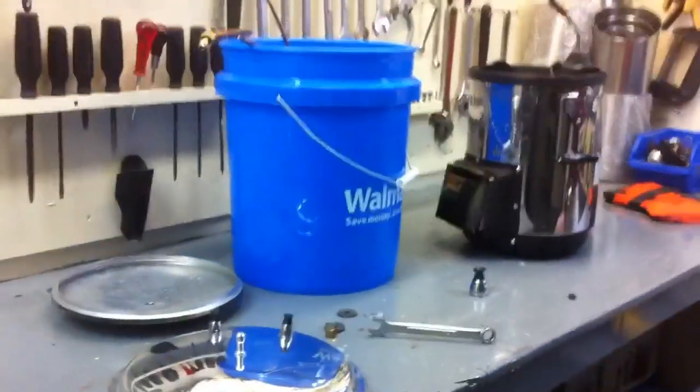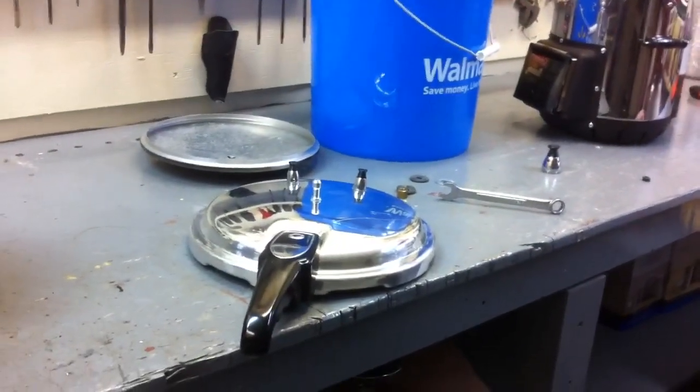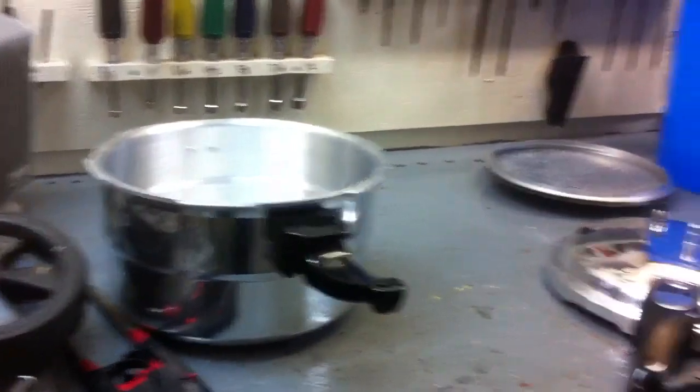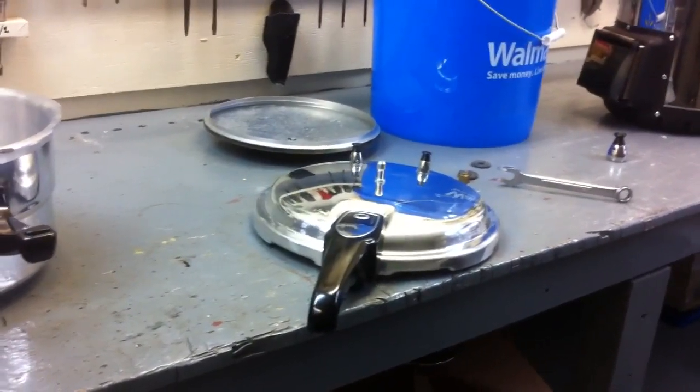This is just a little addition to my water distillation video — an update, if you will. I came across a pressure cooker for the cost of a gasket from my neighbor.